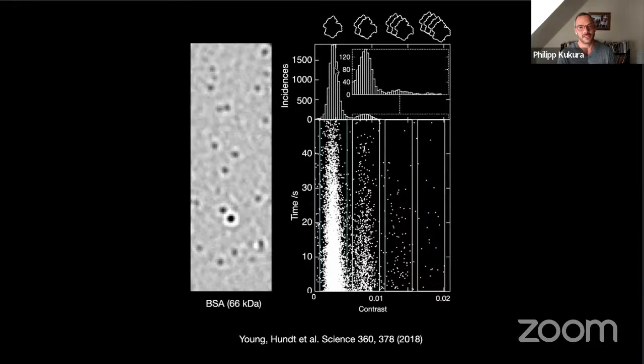I mean, Justin Benesh is my colleague who developed this together with me, and he's a native mass spec expert. He works on heat shock proteins, some of the most polydispersed proteins. And he does co-assembly, exactly the kind of things that you talk about, 2 different monomers of slightly different mass.